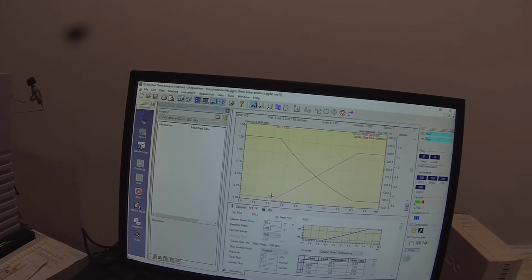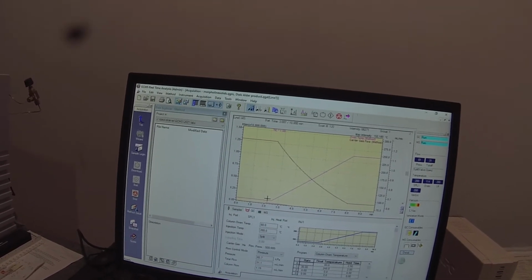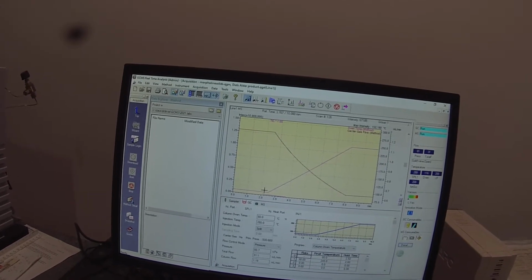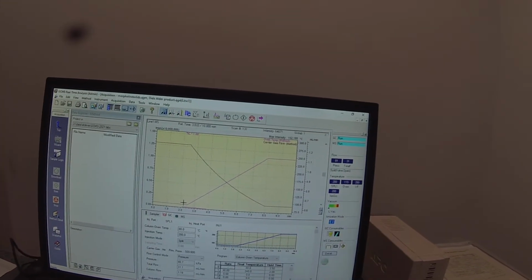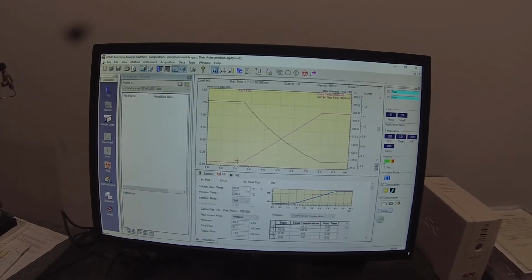And that may or may not correspond to a split of 25, which is what we have it set here. So we're rising fairly rapidly. We'll see the temperature of the oven is now 116, now 119, and it will hit 245 and then stay there for 2 minutes.